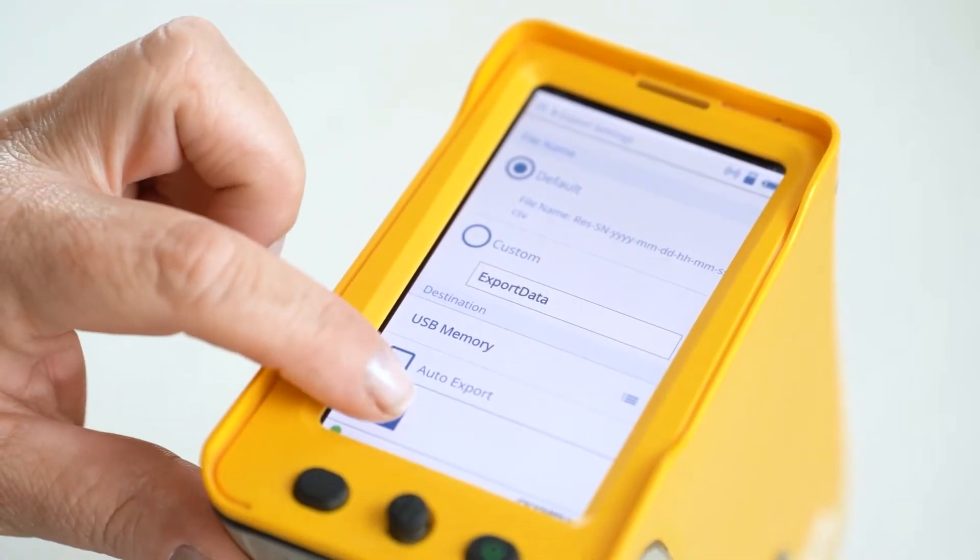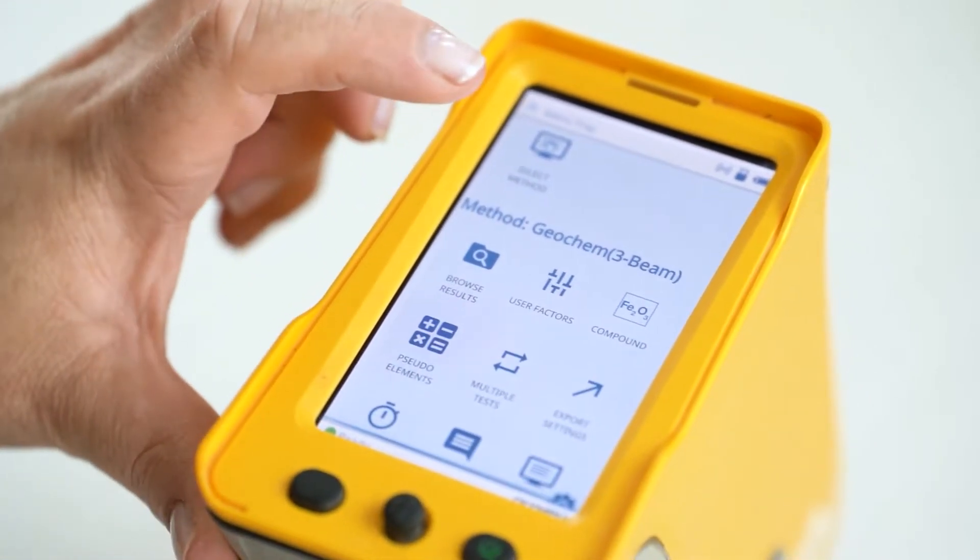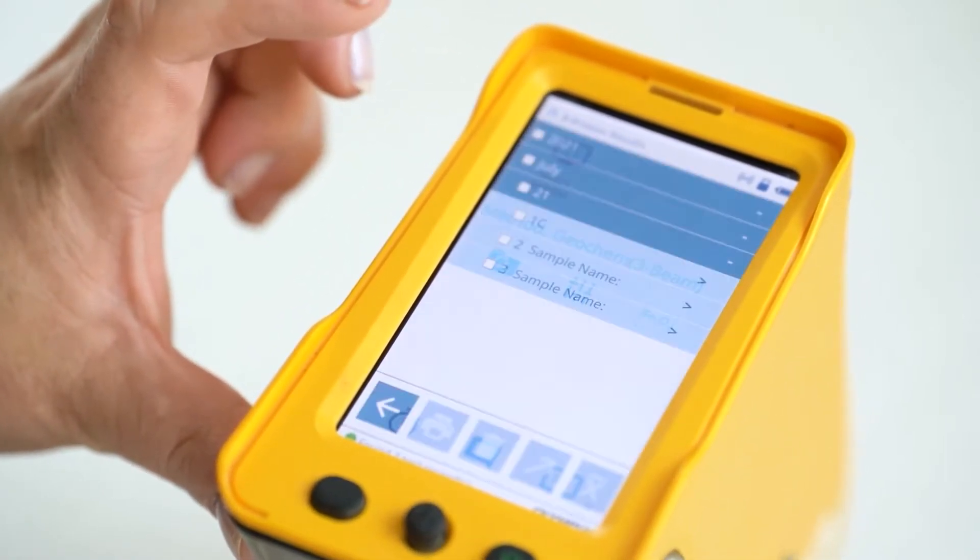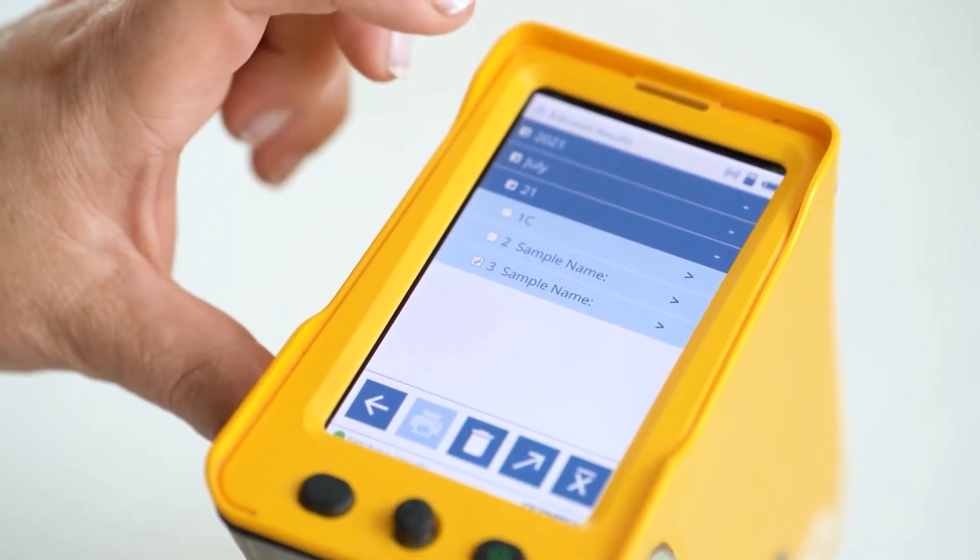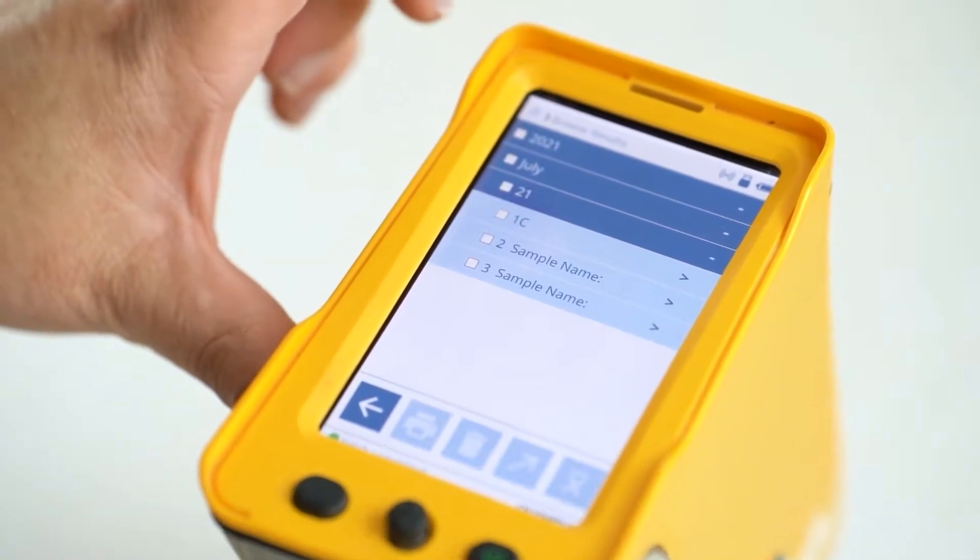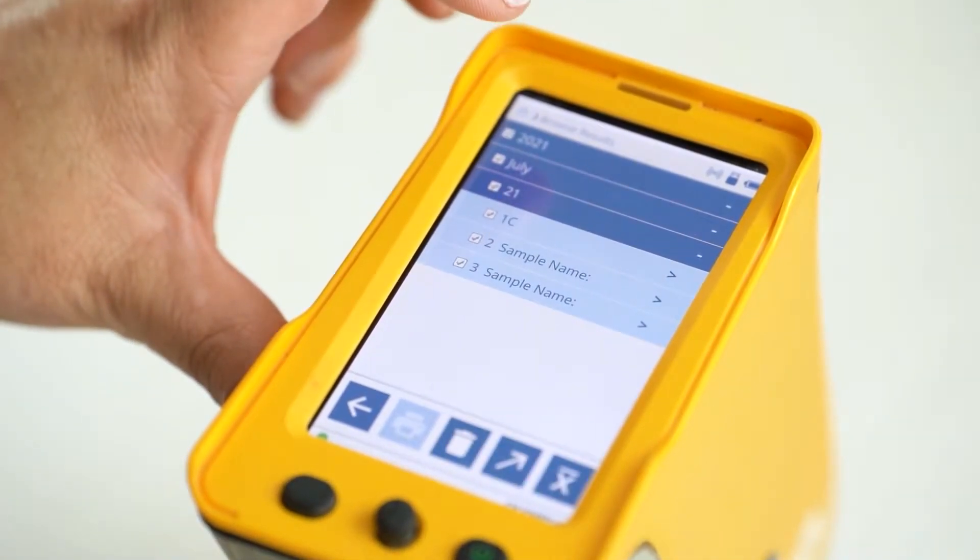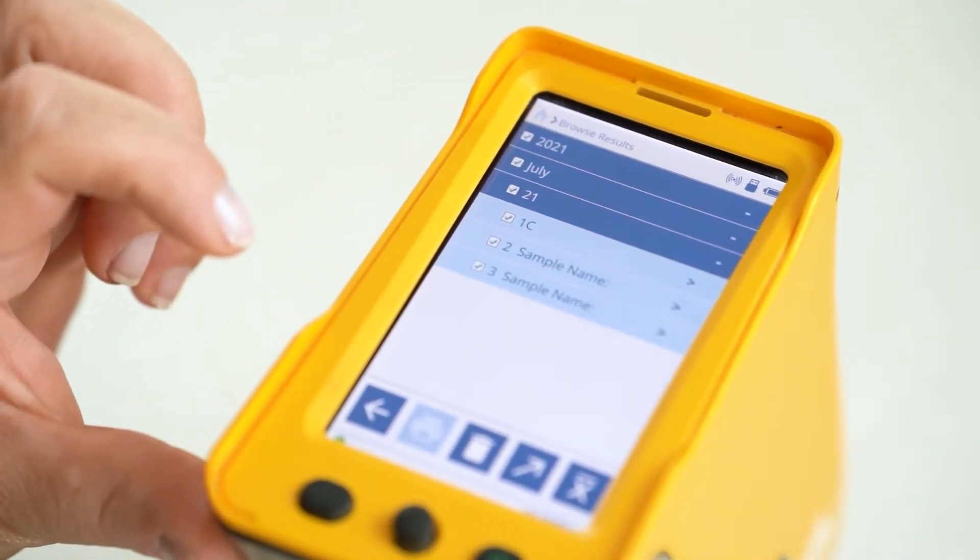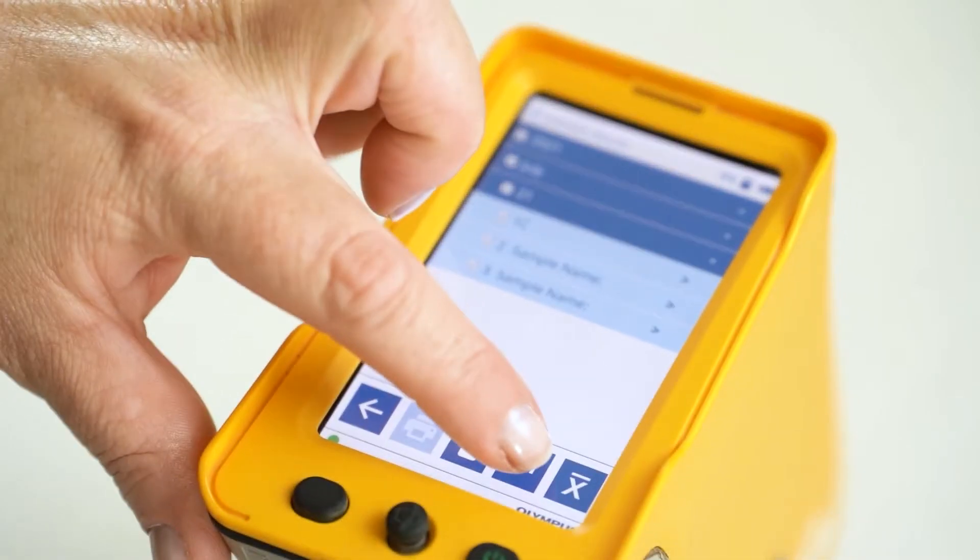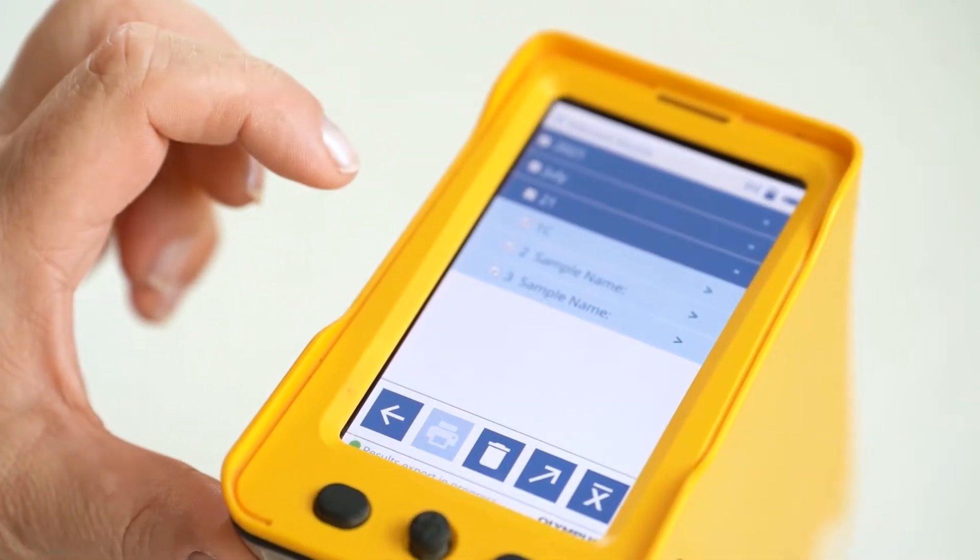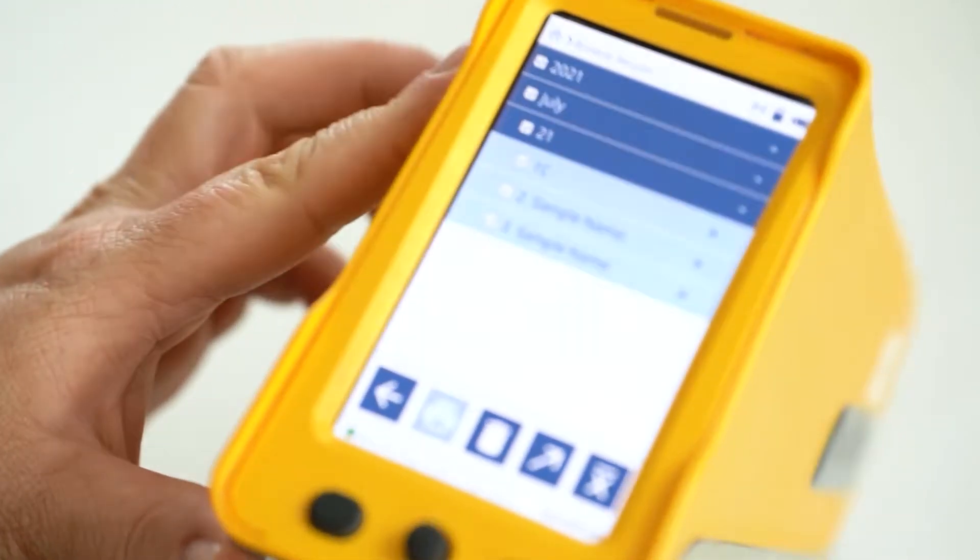Press the back arrow key to go back. Press browse results, and here you can select single results or all results by clicking the button at the top, and then the export arrow key. Now the results should be on the USB.